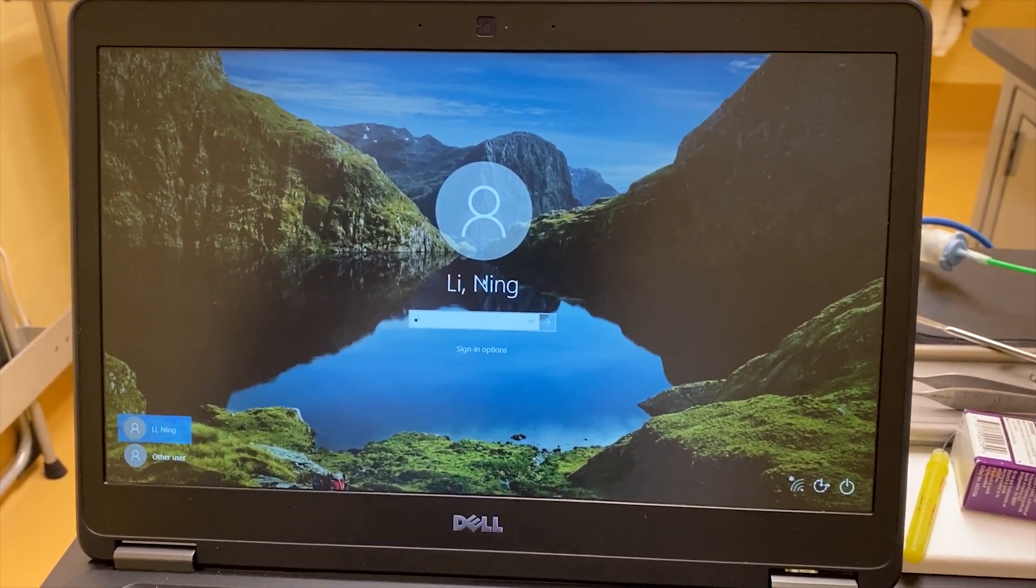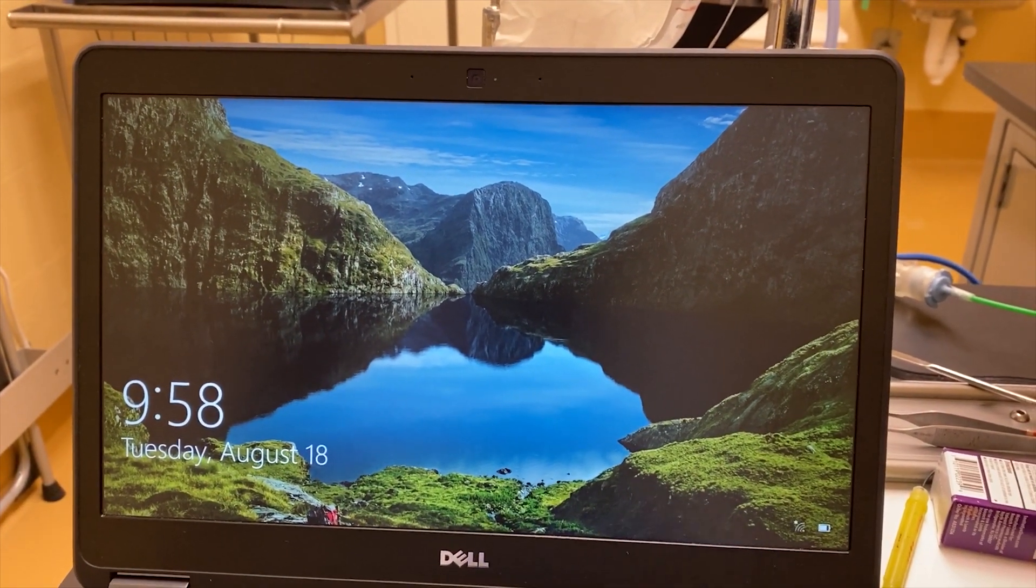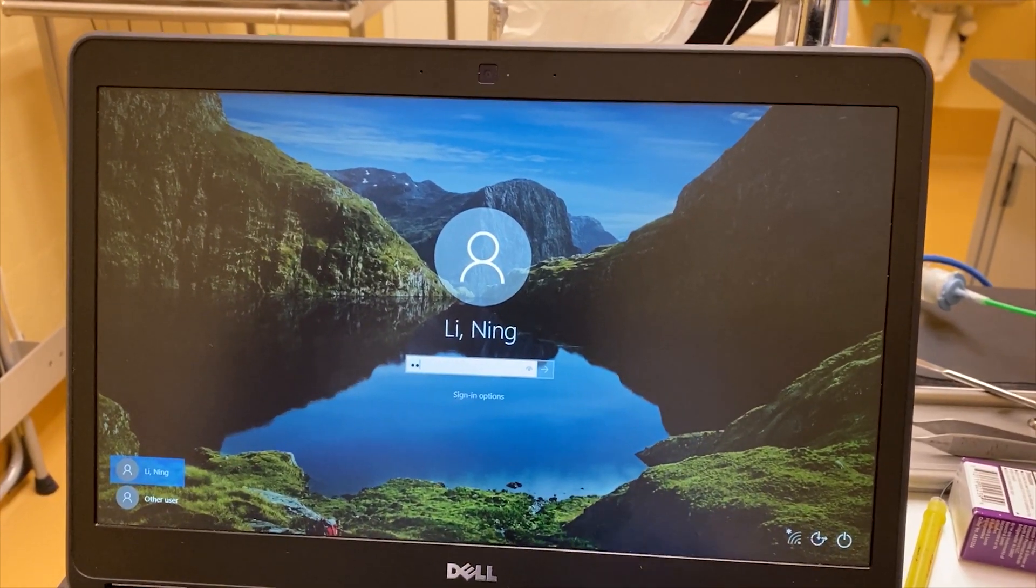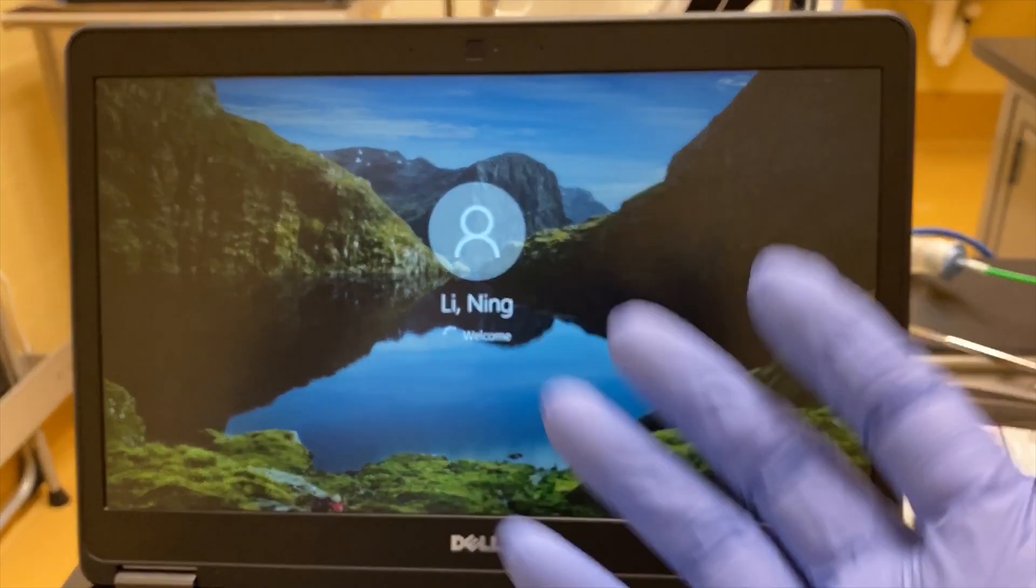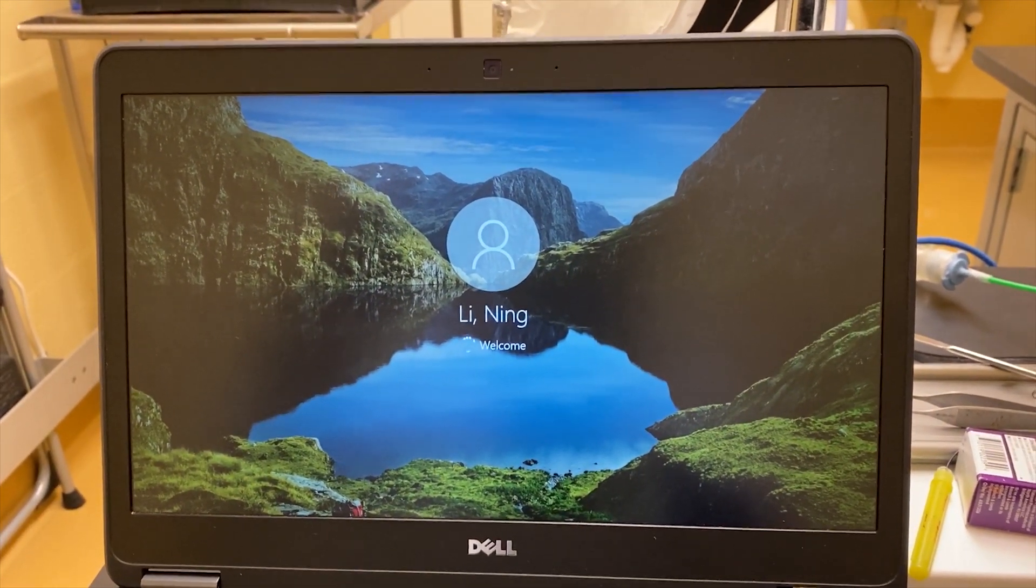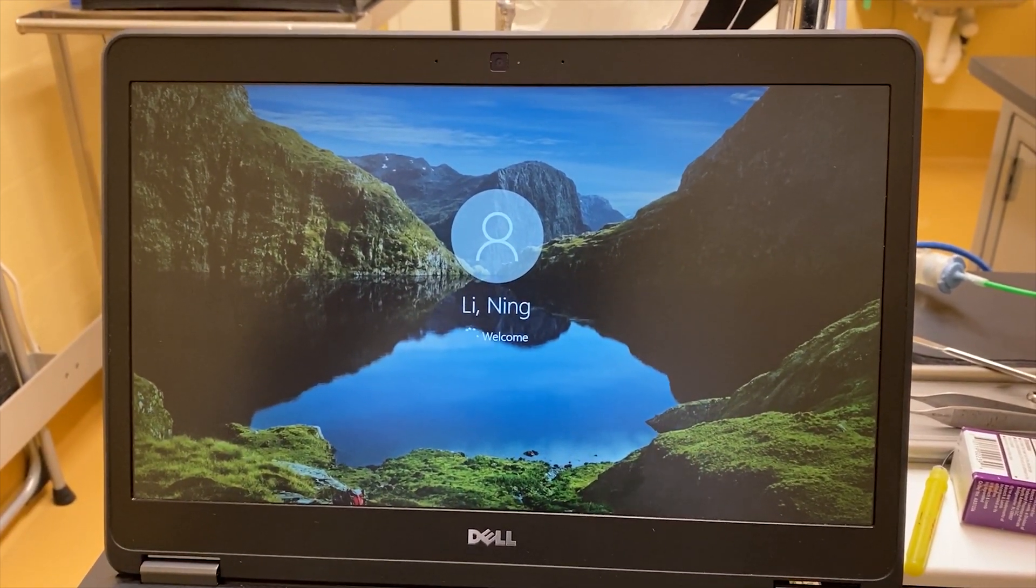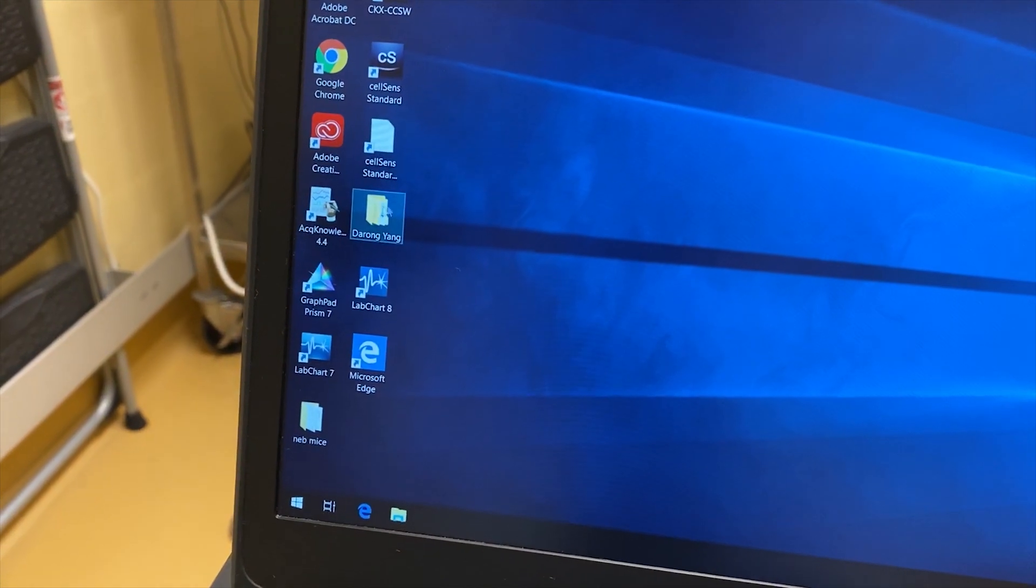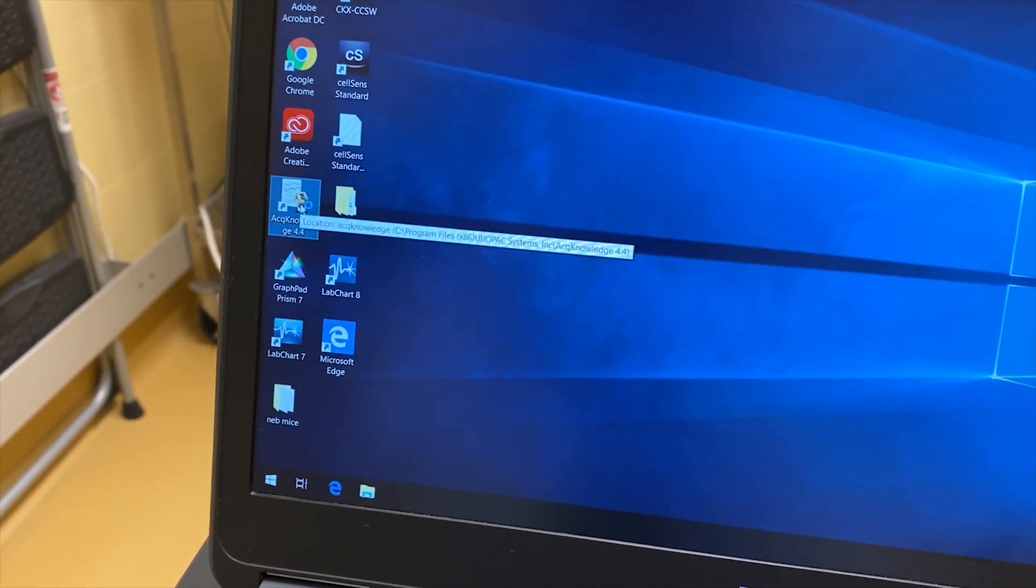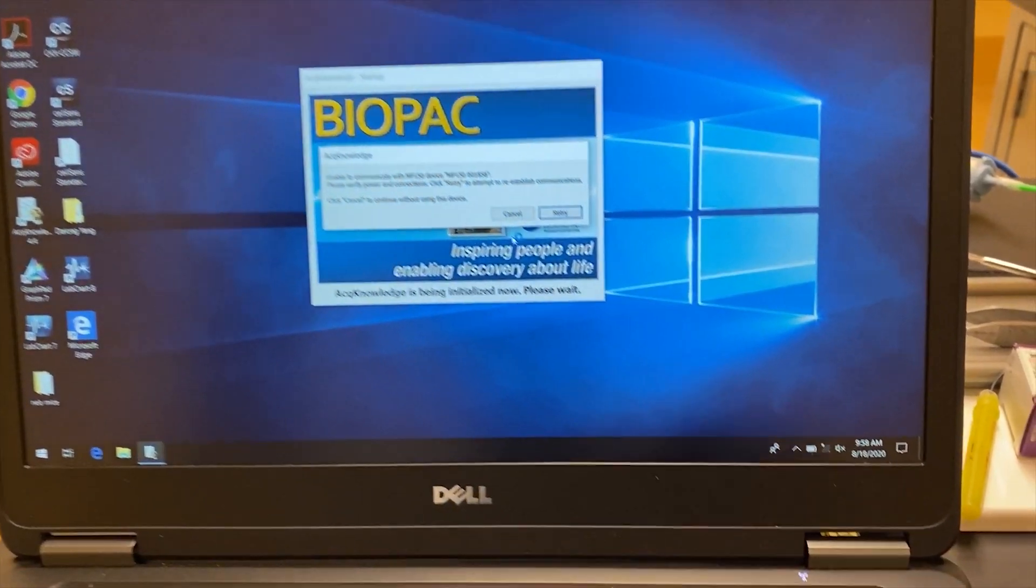And so this computer has a weird thing, you can see if you log in, you need to log in a second time. It's not your password, I don't know why, but you need to log in two times and you will get the desktop. It's a little slow and select the software, Acknowledge.